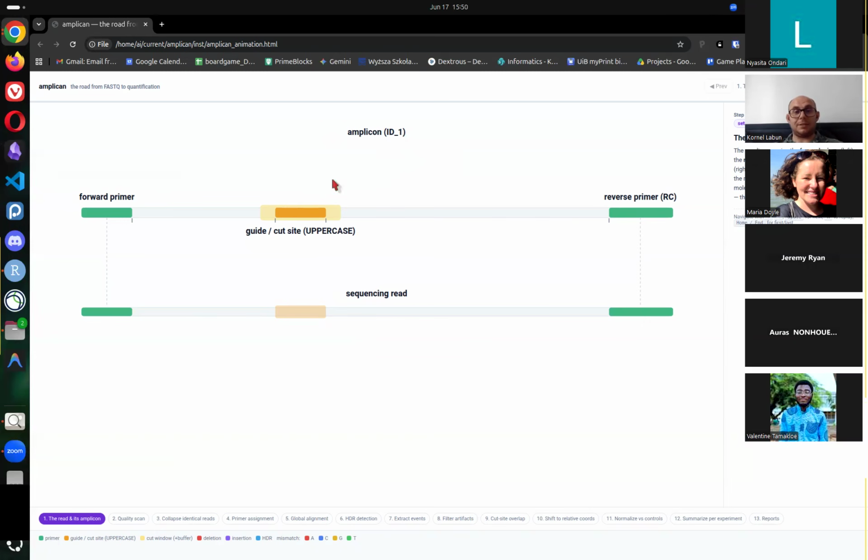That's gonna give us a confusing view from the perspective of my forward and reverse reads, because this read will just terminate over here. You don't know what is happening. This read will terminate over here, and you have no confirmation of the end, like what is after. And that is the most useful.